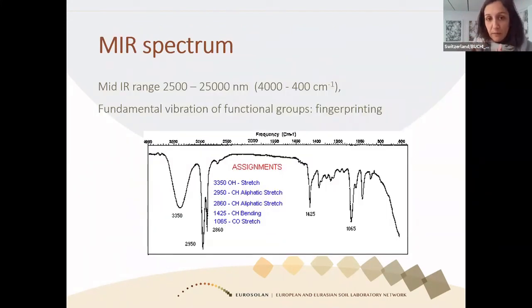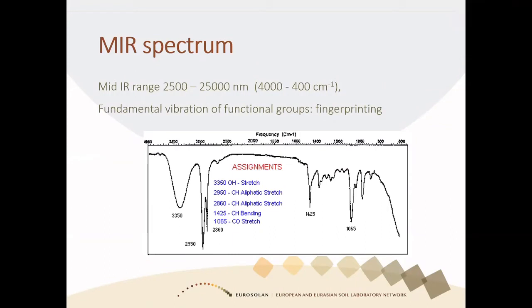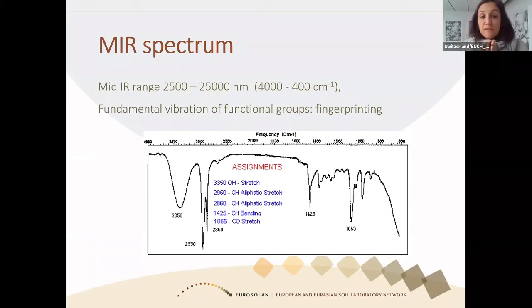Until now I was talking about IR, but we have two adjacent portions of the electromagnetic spectrum, the mid-infrared and the near-infrared. The mid-infrared is the portion that goes between 2,500 and 25,000 nanometers, although normally MIR is referred to in wavenumbers, a measure of frequency, which would be 4,000 to 400 reciprocal centimeters.